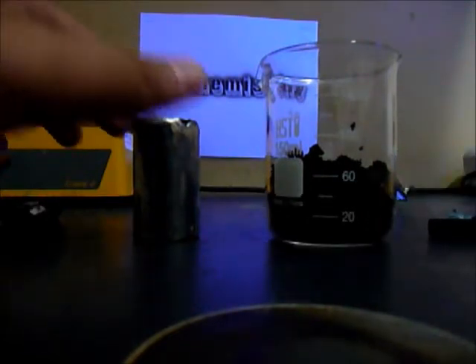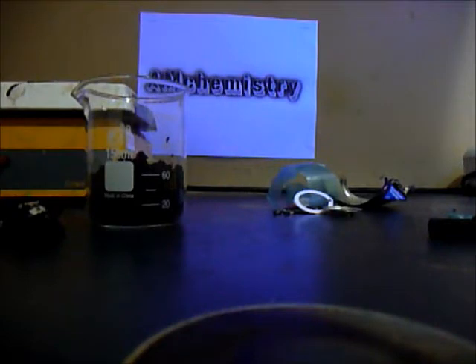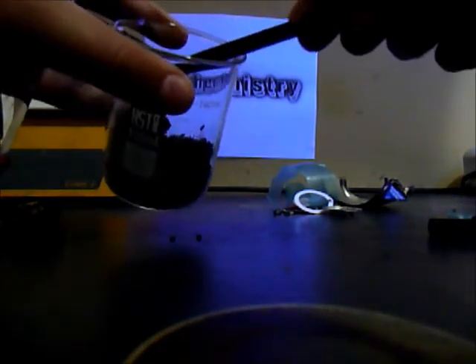So, to test if it's manganese dioxide, it will decompose hydrogen peroxide, because manganese dioxide is used as a catalyst, which means it's not used in the reaction. Okay, I'm putting some hydrogen peroxide, and you see, it reacts with it. And you can see that the gas, it's pure hydrogen. No, not hydrogen. Oxygen.